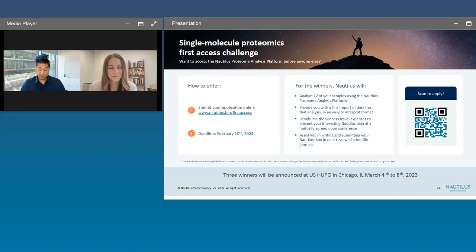Yeah, that's a great question. Oftentimes, when we think about the assay, we're working really hard to build affinity reagents that are very tight binders, but how do we get rid of them?